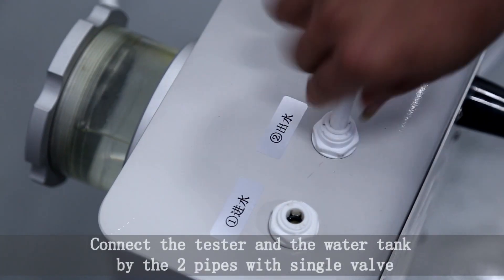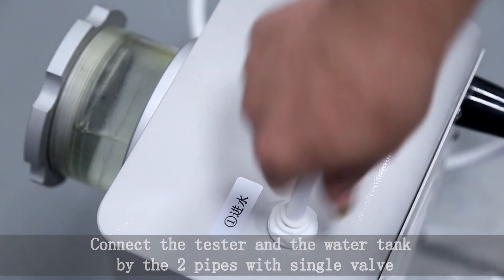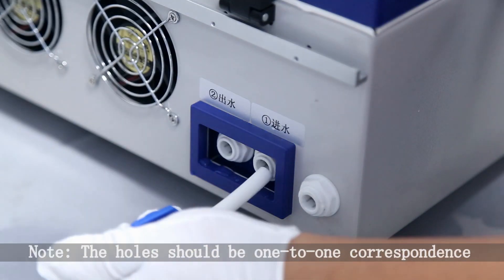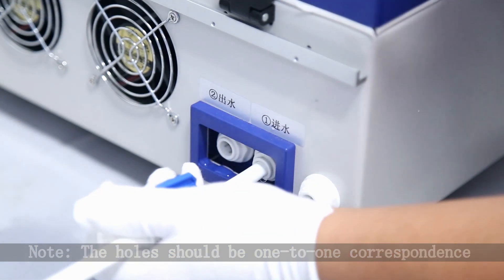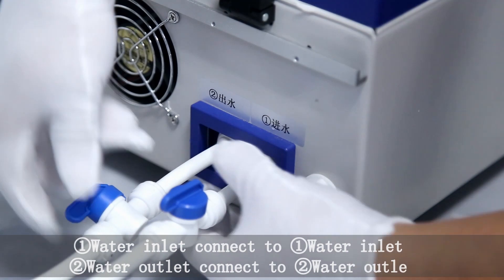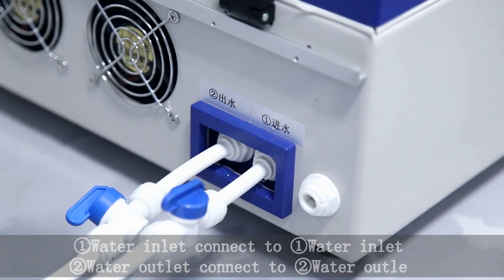Connect the tester and the water tank by the two pipes with single valve. The holes should be one to one correspondence. Water Inlet connects to Water Inlet 1 and Water Inlet 2.